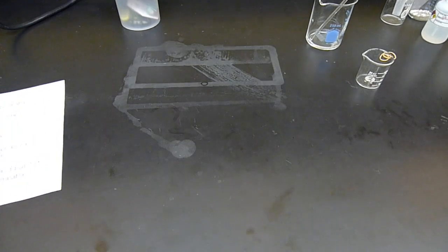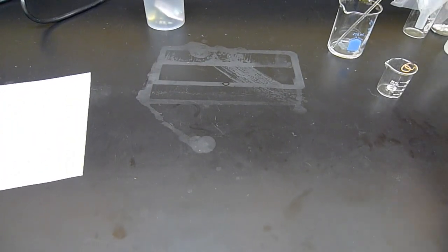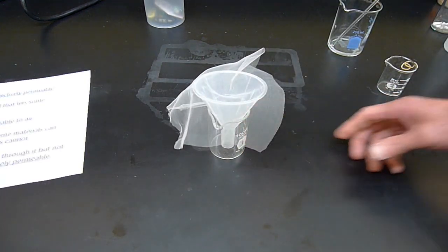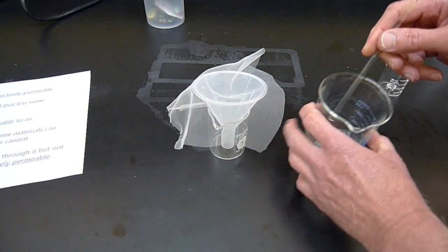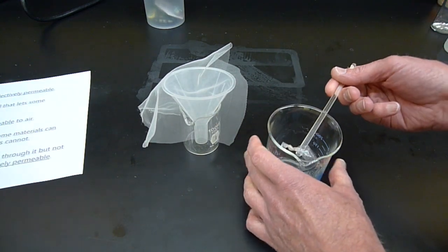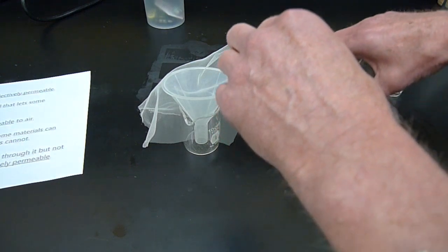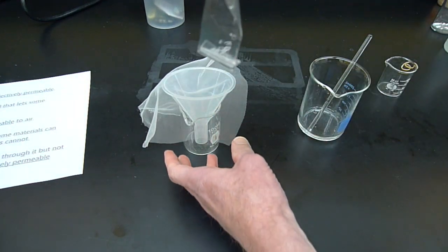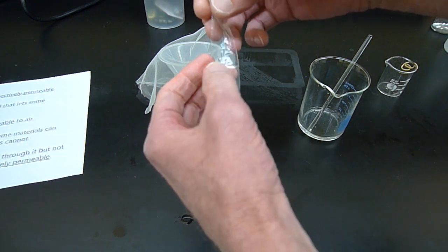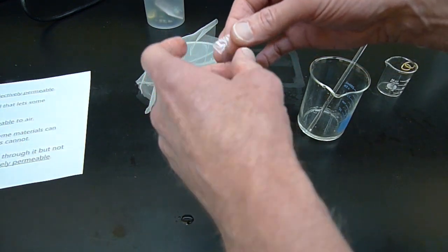To do a simple example of semi-permeability, I have here a piece of mesh. For the actual experiment, we are going to use this piece of dialysis tubing. It's a plasticky type material, and you have to keep it wet so that it stays pliable. It has pores in it.